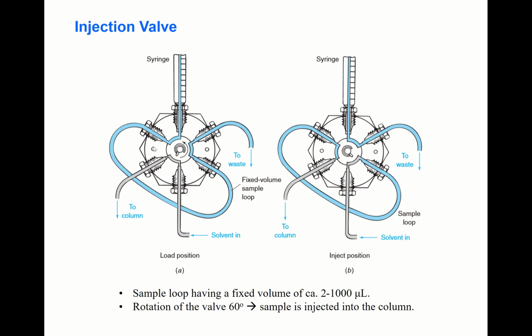And then you change this position. These two ports are disconnected, and there will be a new connection from here to there. After turning this valve, although you inject your sample, that sample doesn't go to this loop, but goes to the waste. In the meantime, since you changed this valve, there is a new connection here. Look at that, this part and this part and this part.